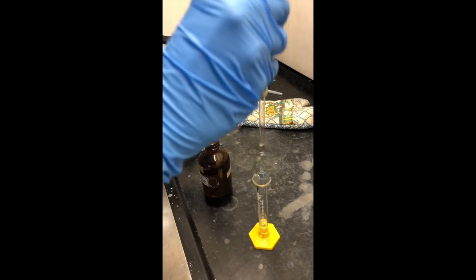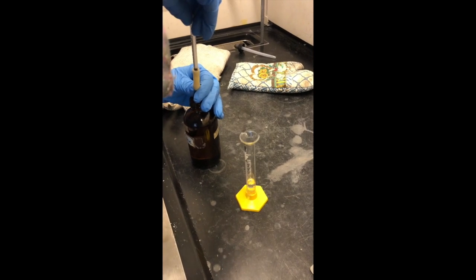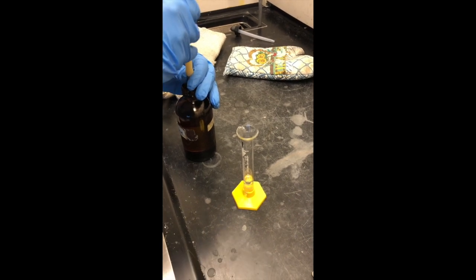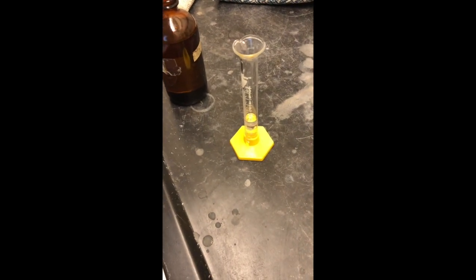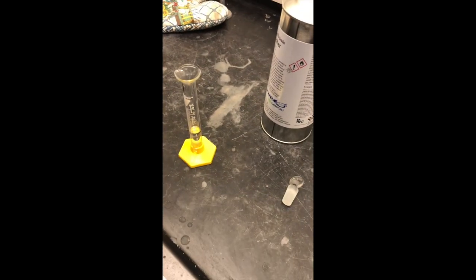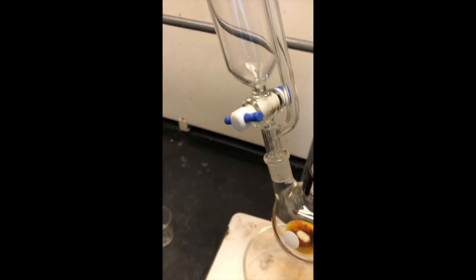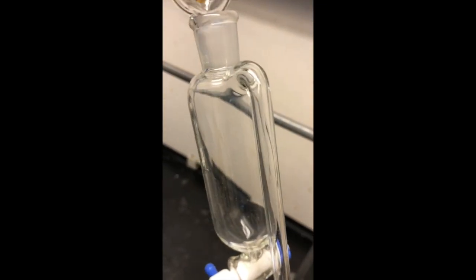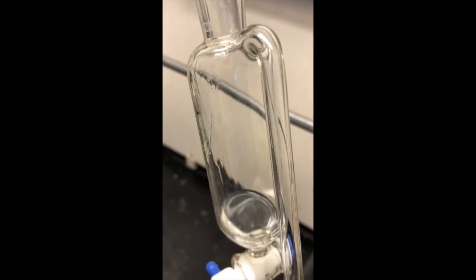Now we are measuring the bromobenzene, getting the correct volume of about 1.2 mLs — two portions of 0.6 mLs from the syringe pipette into 3 mLs of ether. Once we have that solution made up in our graduated cylinder, we will make sure that our addition funnel is closed, meaning the stopcock is horizontal, and add it in there, being careful not to pour down the arm. That's why we have the pressure equalizing arm in that position, so we're not tempted to just pour through it.